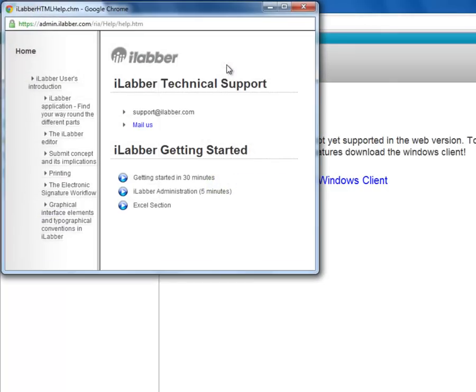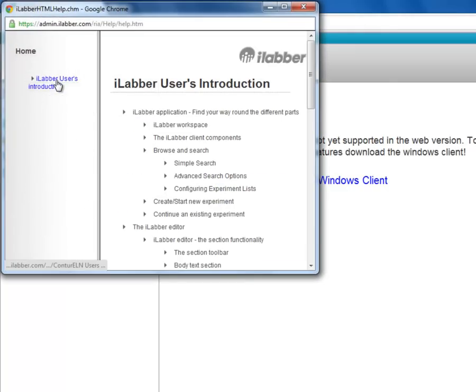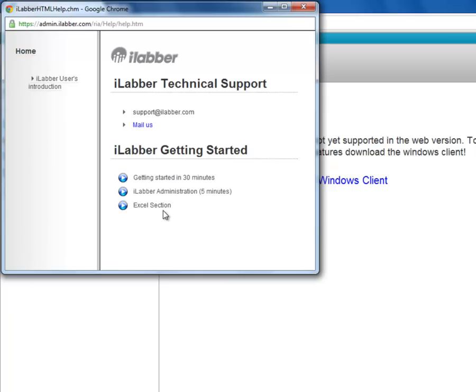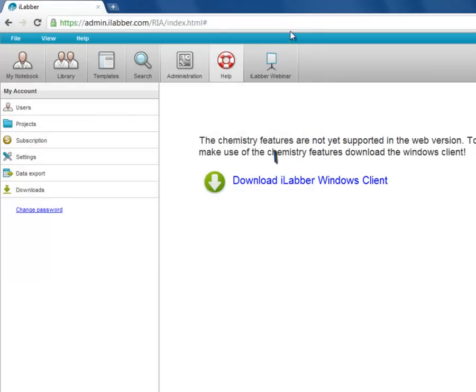The sixth button is the help menu. Here you have a help screen where you can browse through these different help pages, and you can also watch some videos about iLabr. The final button is for the iLabr webinar. We hold webinars most Tuesdays, and these are free to attend. If you wish to attend one, just click on this link to send the email.